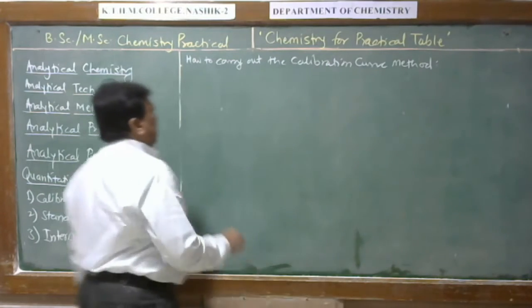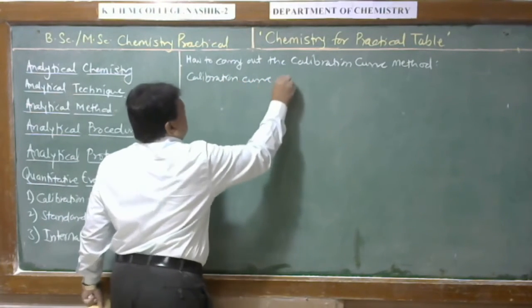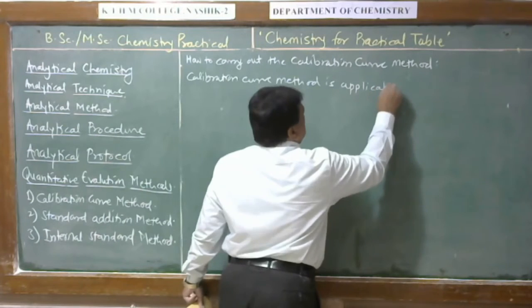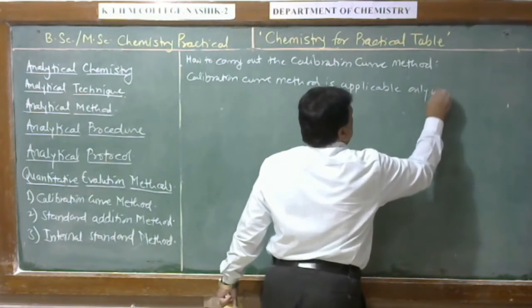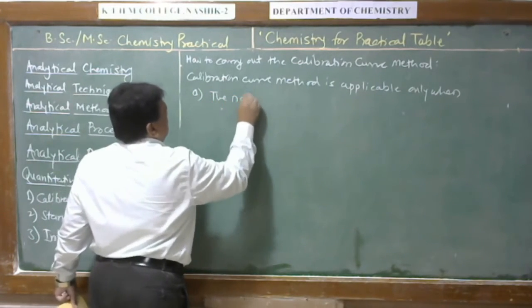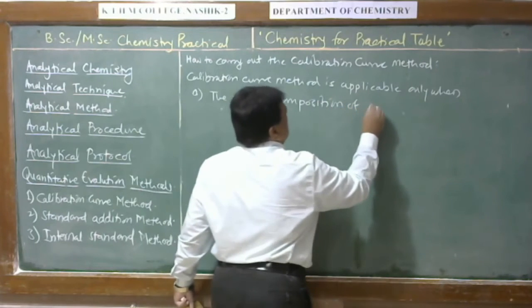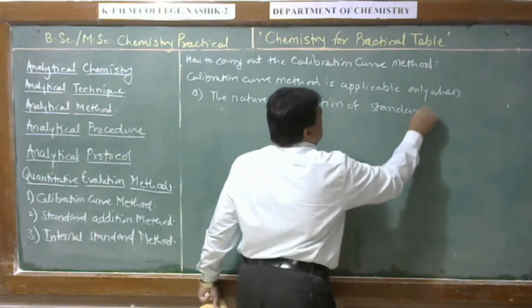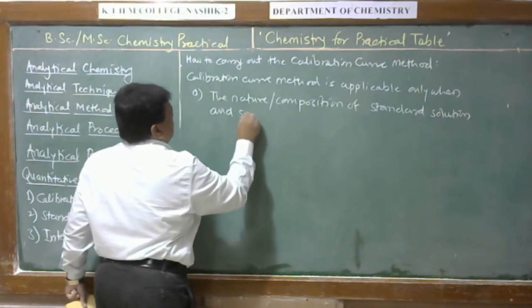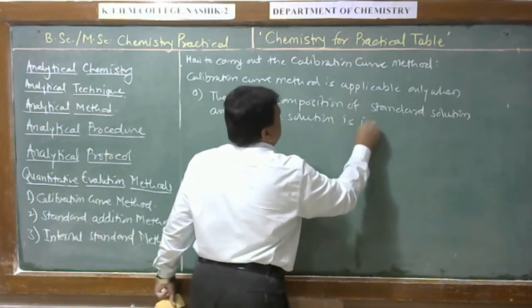Calibration curve method is applicable only when, number one, the nature or composition of standard solution and sample solution is identical.